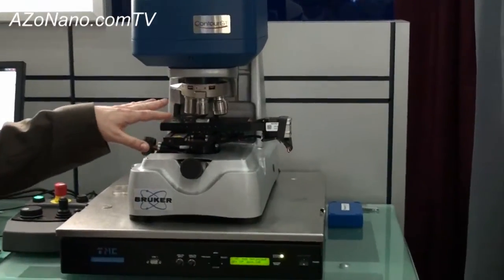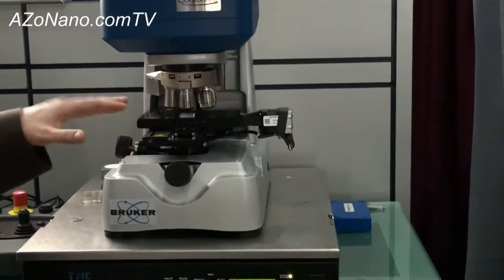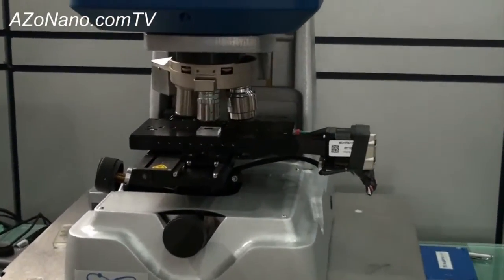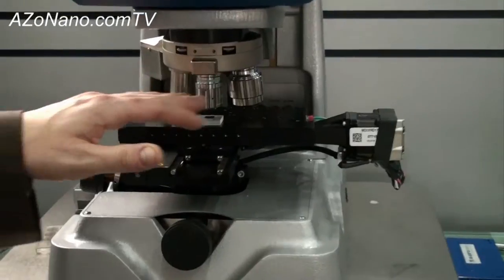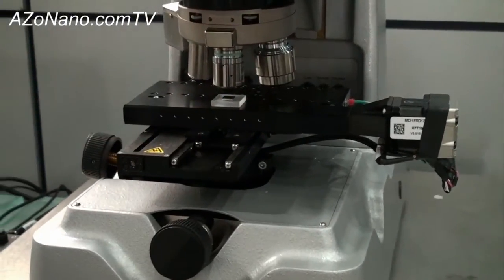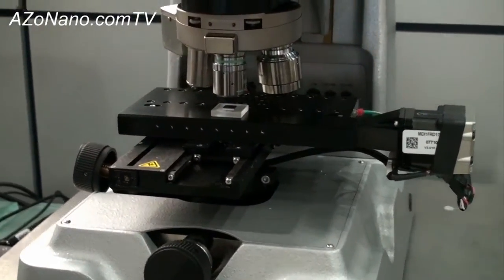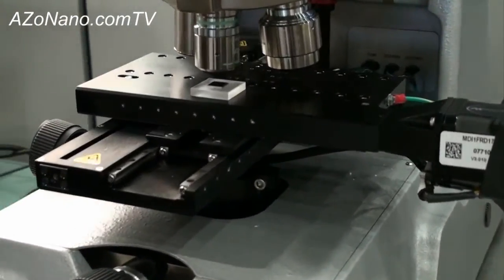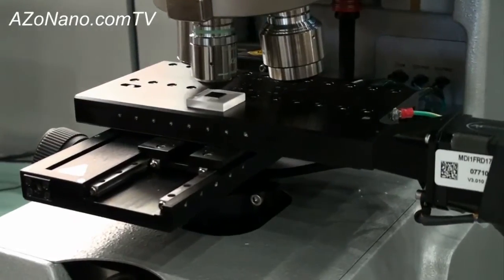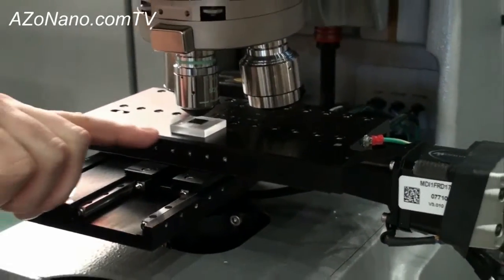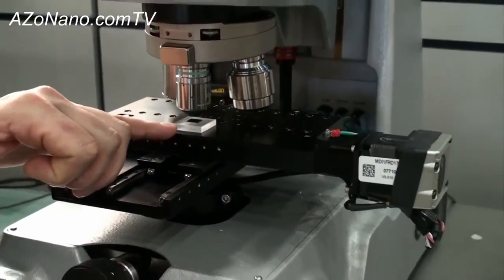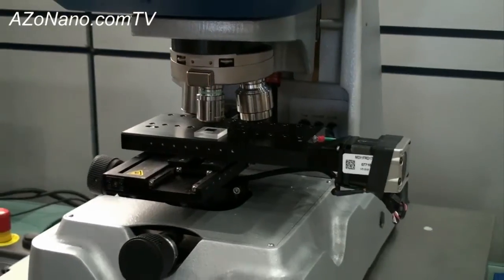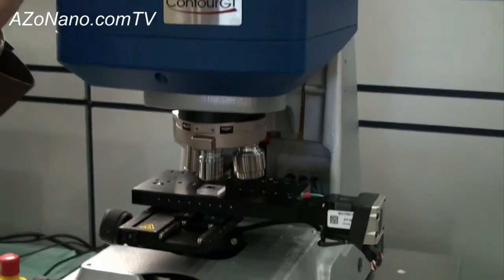I'm going to point over here to some of the things. So the actual interference is generated in the objectives. The objectives here are what make the interference pattern. There's a beam splitter and a reference surface in there. The light goes down to where the sample would sit and then it comes back up and is captured by our camera.